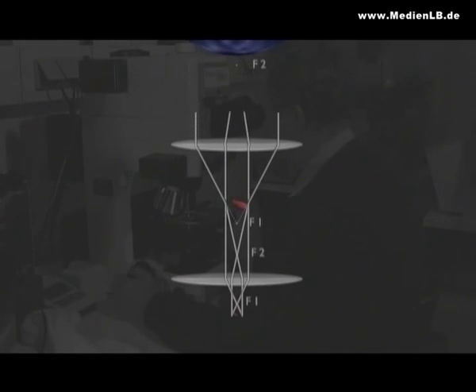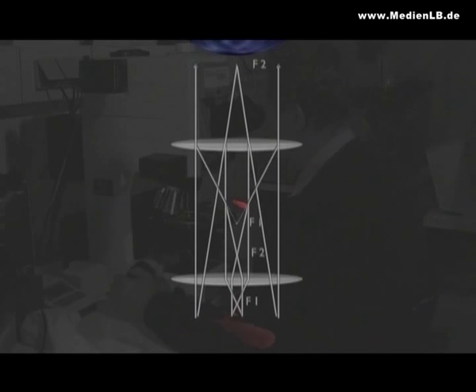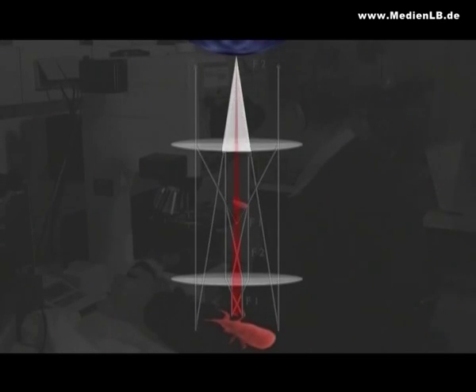The latter works like a magnifying glass and now creates a new, magnified image, which is projected outside again by the eye. This, too, leads to a correspondingly enlarged visual angle.